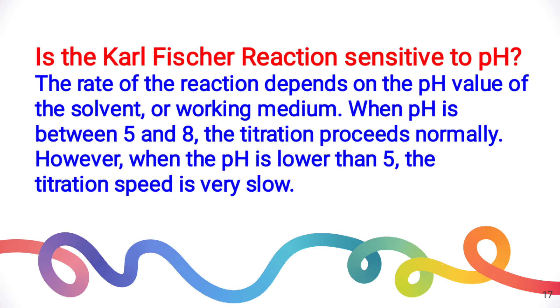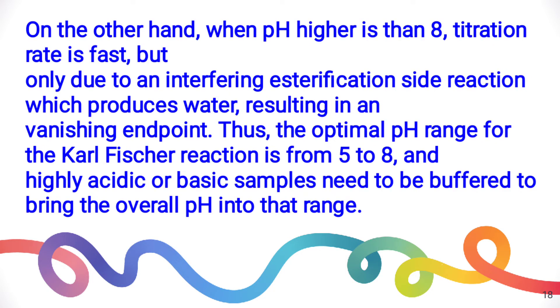Is the Karl Fischer reaction sensitive to pH? Yes, it is sensitive to pH. The pH range must be between 5 to 8. If the pH is lower than 5, the titration speed becomes very slow. If the pH is higher than 8, the titration rate becomes fast due to an esterification side reaction, which produces water and results in a vanishing endpoint. So the optimum pH range for Karl Fischer reaction is 5 to 8, and highly acidic or basic samples need to be buffered to bring the overall pH into that range.